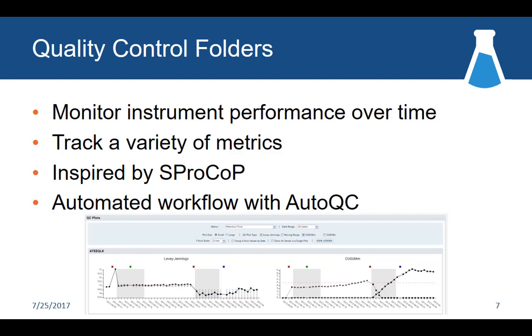So we're looking at a given metric, this is retention time, and we are looking at a given peptide, which is part of my QC sample. So typically, we've geared this around running, say, 10 to 20 or so QC peptides that you're really monitoring. You know that they're stable. You know that they're well characterized. You've got a kit. This might be an IRT kit or some other source of that kind of stable peptide library. And then what we have on the x-axis is time.